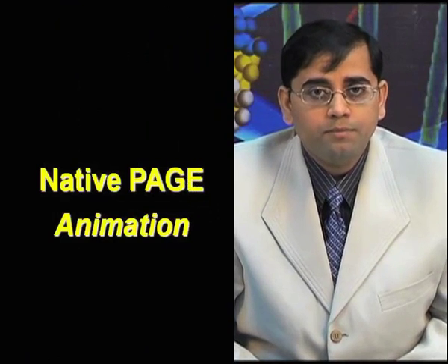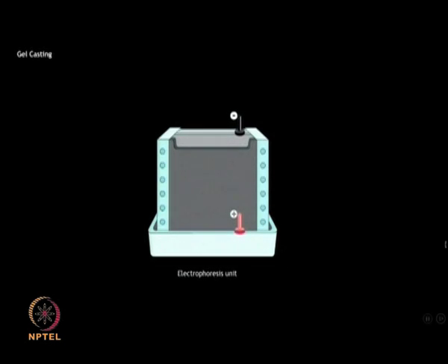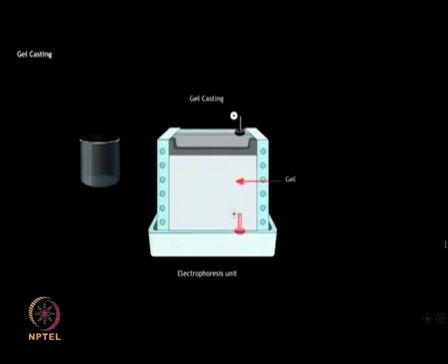I will now show you an animation how to perform the native polyacrylamide gel electrophoresis. Blue native PAGE or BN PAGE. The polyacrylamide gel is cast between the glass plates as a vertical slab in the same buffer that is used for electrophoresis. The gel is prepared by free radical induced polymerization of acrylamide and bisacrylamide in a suitable buffer.